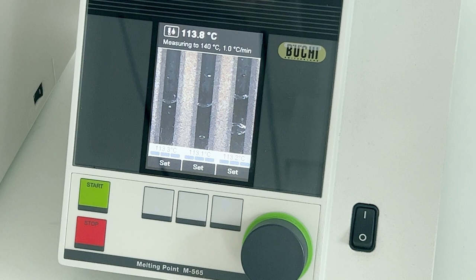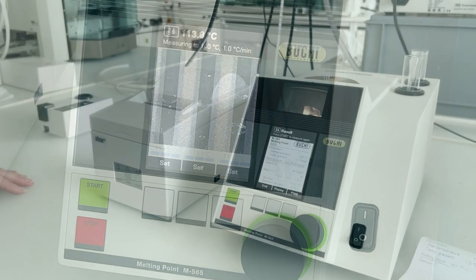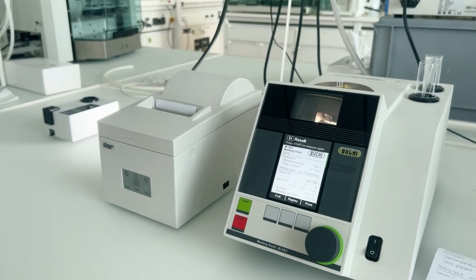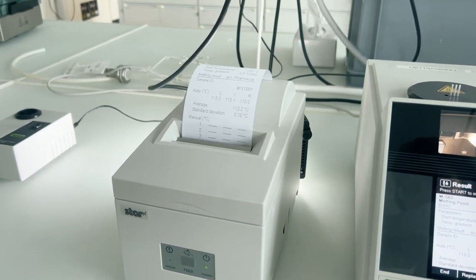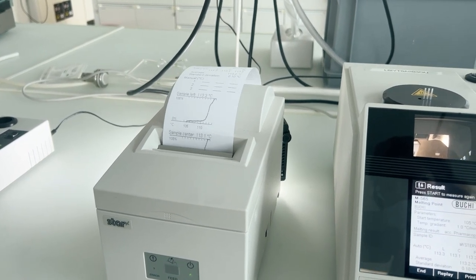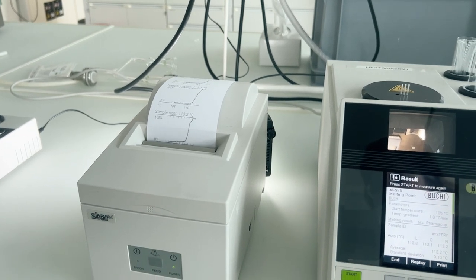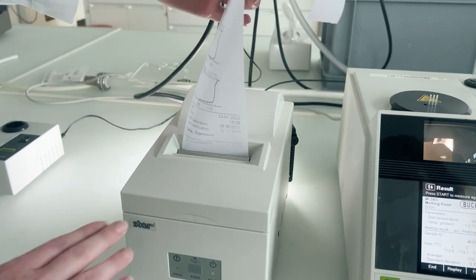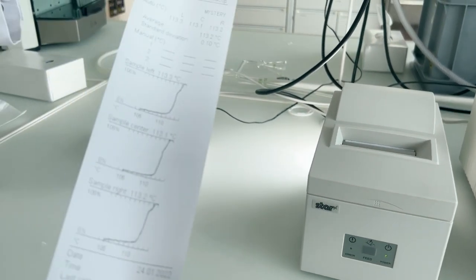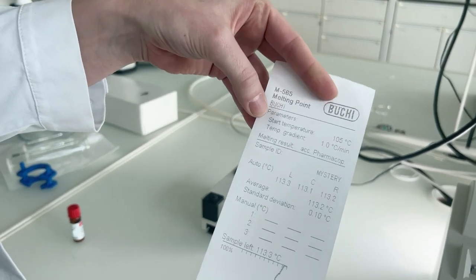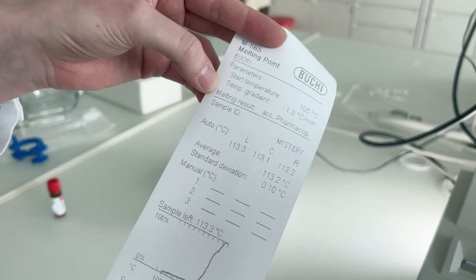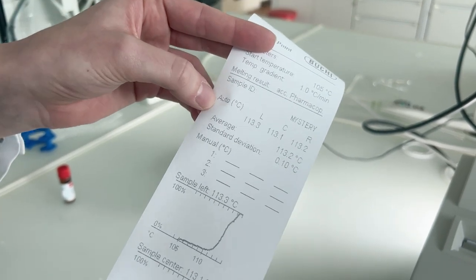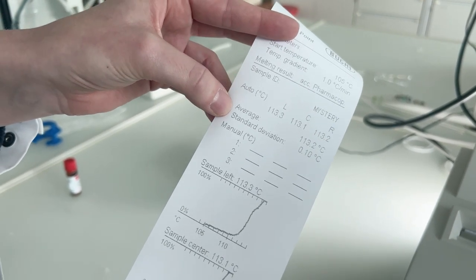Everything is now clear and the melting process has ended. The melting point device automatically calculates the end temperature, which is the melting point according to pharmacopoeia. I can now print my results. The printout contains all the important information I need: my parameters, whether I measured thermodynamic or pharmacopoeia melting point, my sample ID, and most importantly the melting point with its average and standard deviation.